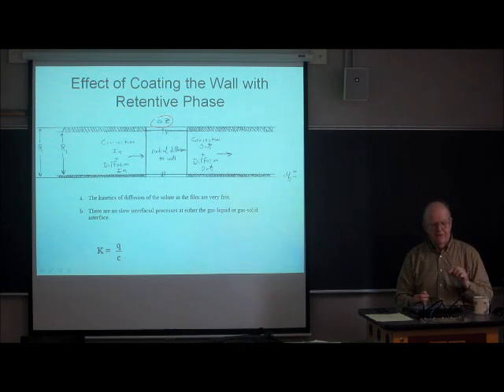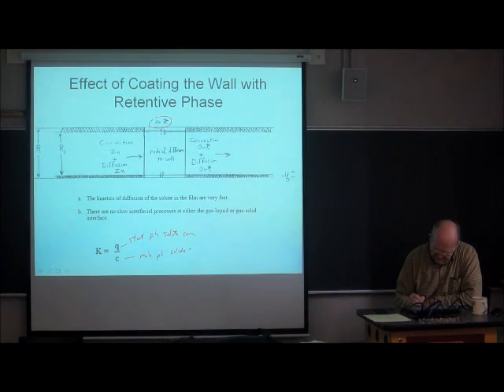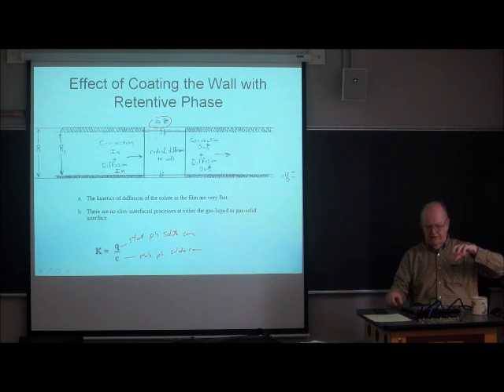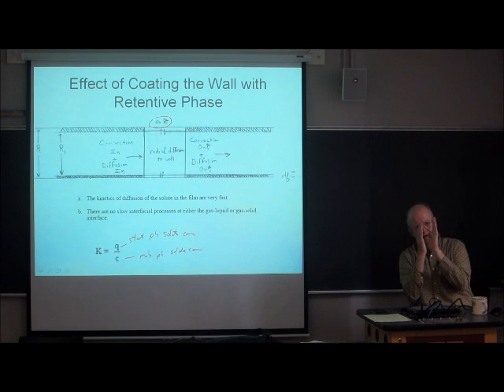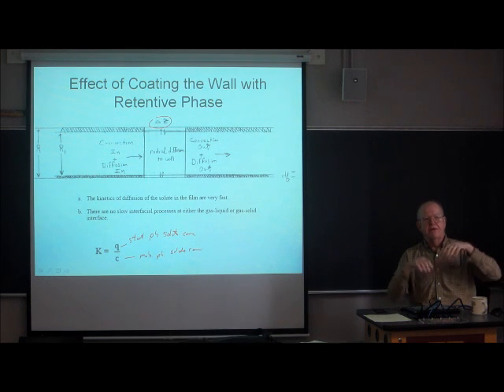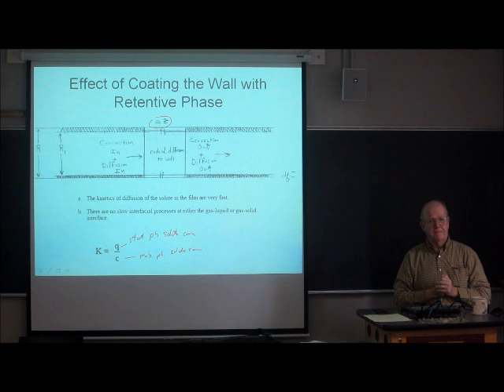The solute is in equilibrium between the mobile and stationary phase. This is the stationary phase concentration at equilibrium. So what I'm saying is that as soon as the solute gets pushed into this little cell, it's going to start to move on its own towards the stationary phase, because it has to equilibrate with it.